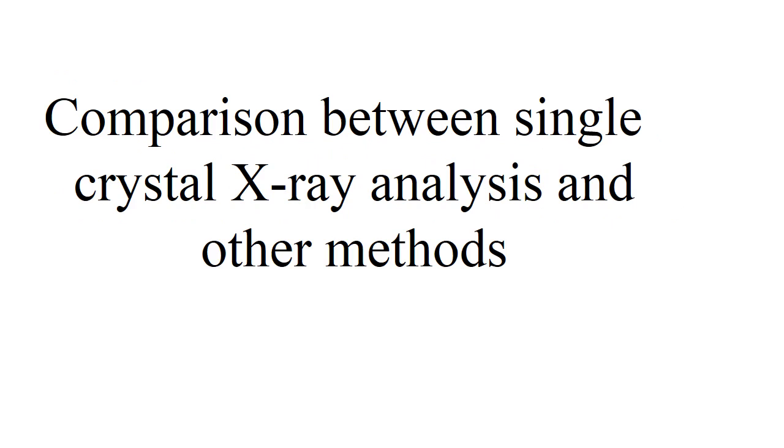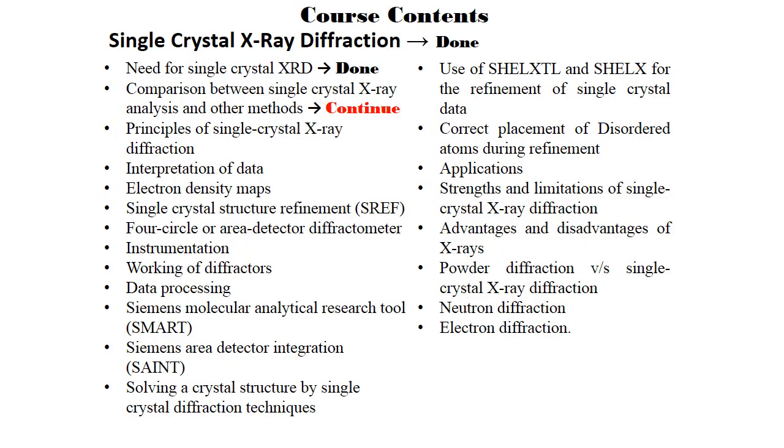Now we are going to compare single crystal X-ray analysis and the other methods used for structure analysis of the crystal. In the single crystal X-ray diffraction technique, in our further lectures, we will discuss all these main points. In the start, we need single crystal X-ray diffraction, and what is single crystal X-ray diffraction?